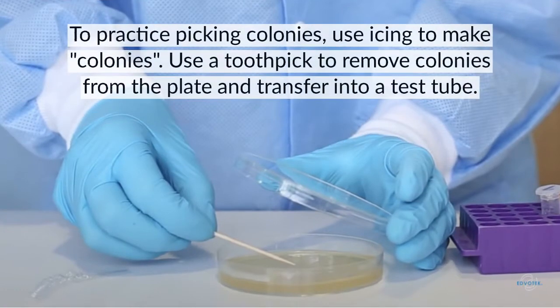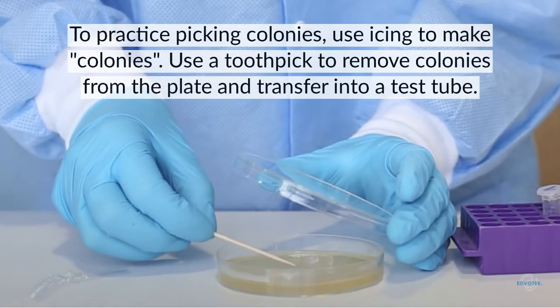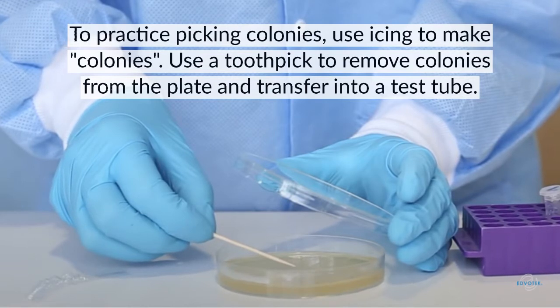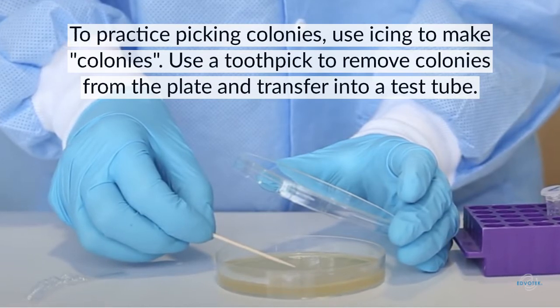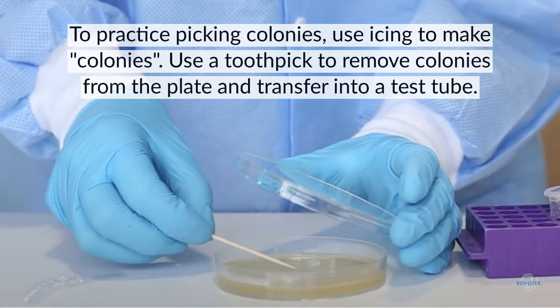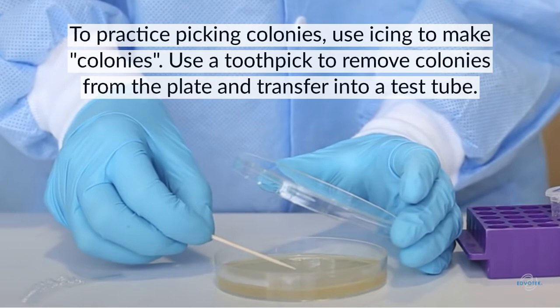To practice collection, create around 10 small spots of icing on a fresh jello plate. Add a small amount of water to a test tube. Using a toothpick, remove a colony from the plate. Next, twist the toothpick inside the test tube until you see the sticky frosting dissolve in the water solution.